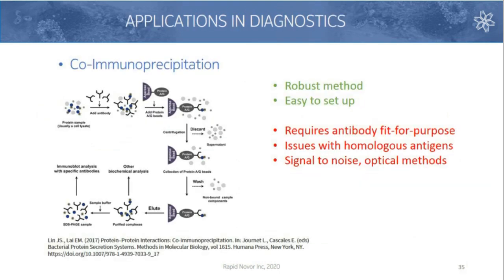I know there was a lot of debate about mouse versus rabbit and things like this, but of course we found that some of our rabbit antibodies are extremely specific to our targets of interest. They don't bind against off-target, high homology targets that are present in the sample as well. And luckily, rabbits are big enough for us to actually do our workflow on because we do require quite a bit of material.